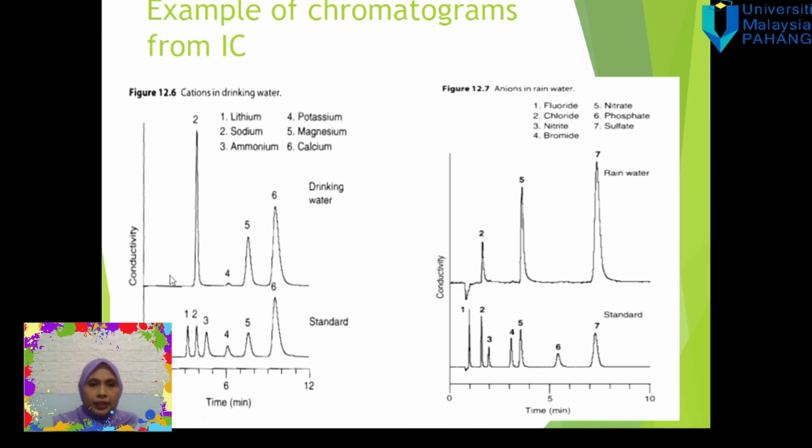So the chromatogram will be separated based on what you are running, because you have to run separately unless you have a dual column. Now they have developed a dual column in which positive and negative charges can be run simultaneously. But if you use a different column, you have a different peak. Like this for the cation, and this peak is for the anion. They have 2 injection systems, 2 different columns and 2 different mobile phases.